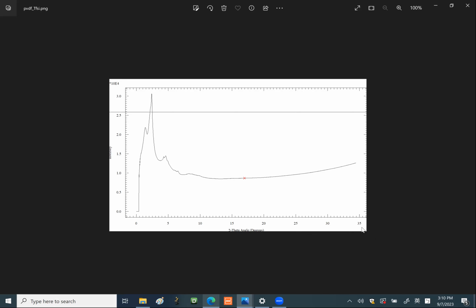Yeah, and also, since we talk about 2-theta, my experience is usually we want to limit the 2-theta below 35. Otherwise, well, it really depends, right? You always want to check your data in the high 2-theta region and see if you have some fishy bumps or some kind of unreasonable glitches that you really want to throw away, even when processing the 2D data, right?